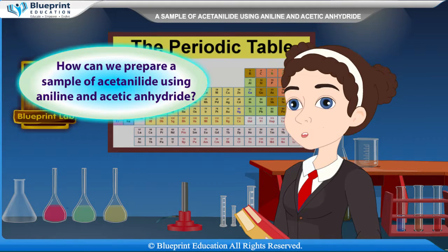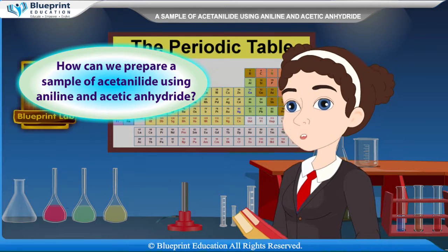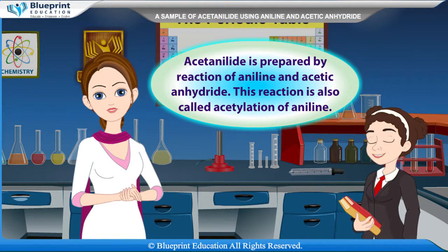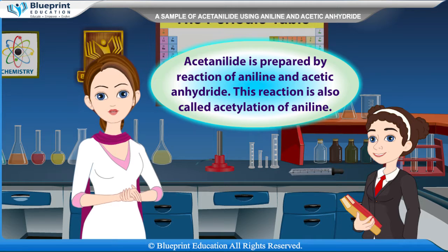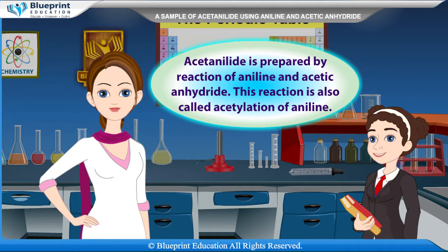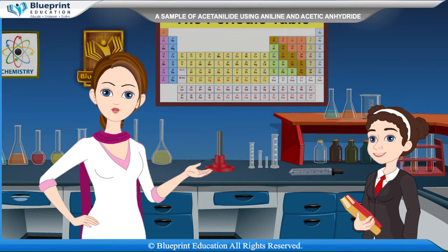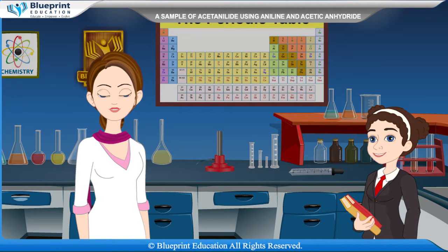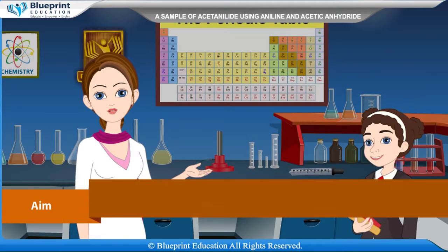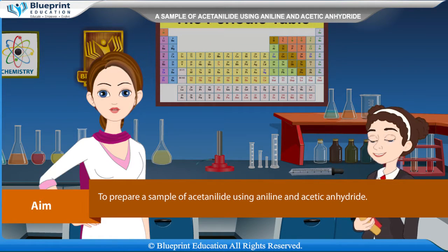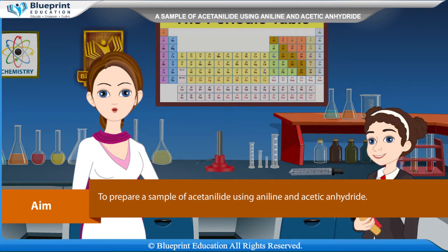Ma'am, how can we prepare a sample of acetanilide using aniline and acetic anhydride? Acetanilide is prepared by reaction of aniline and acetic anhydride. This reaction is also called acetylation of aniline. Our aim here is to prepare a sample of acetanilide using aniline and acetic anhydride.